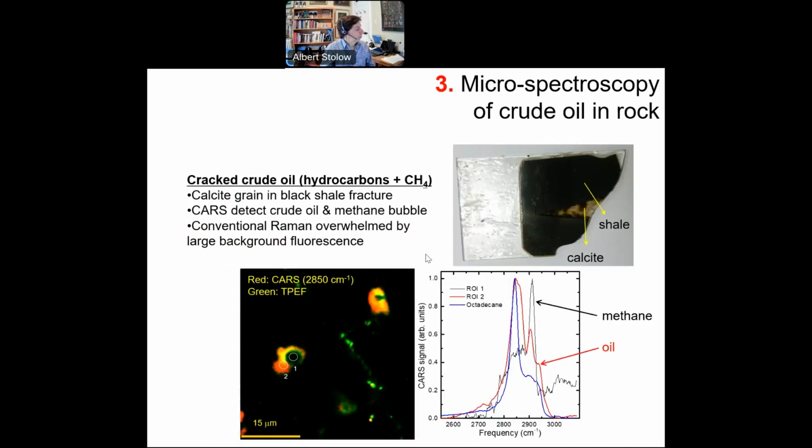I can actually say a little bit more about the nature of the heavier oils by the Raman spectrum. I mentioned to you that the Raman spectrum identifies molecules by their vibration. Well, in fact, I can see that the Raman spectrum of methane in black and the red, which is this region here, are different. They have different Raman spectra. So this is definitely a higher oil. This is octadecane, which is a test sample to show that in fact this red part here must be a much higher hydrocarbon, much larger hydrocarbon than methane because of the Raman spectrum.